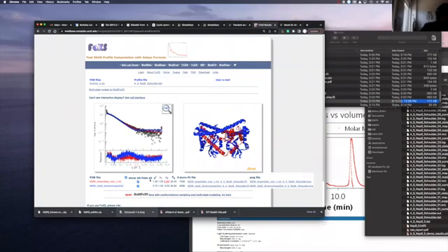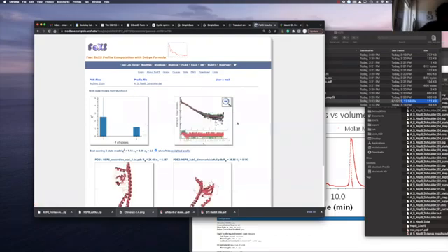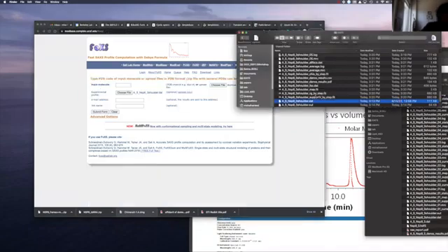You can already see that the monomeric state, the compact structure, fits the data almost nicely, but there is overfitting with this parameter called the hydration layer, c2. When you hit the multi-state, the fit improves from 2 to 1.1, which is almost perfect, and the hydration layer became a little bit more normal. The most important information is here. All the residuals improve, the fit is better, but mostly you can also see the weights: even at the shoulder, you have a few percent of this dimeric state. It would be interesting to compare that monomer-dimer ratio for the peak data.